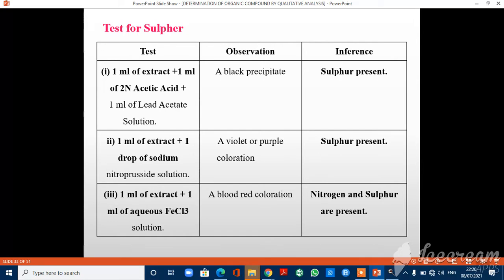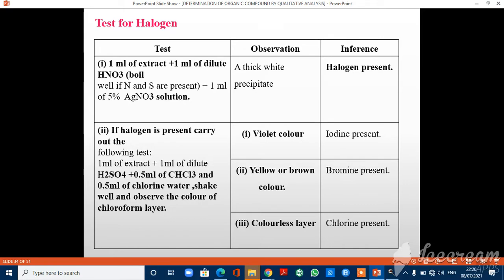Another test for sulphur: add 1 ml of extract plus 1 drop of sodium nitroprusside solution. If a violet or purple coloration is observed, sulphur is present. A third test: 1 ml of extract plus 1 ml of aqueous FeCl3 solution; if a blood-red coloration is observed, both nitrogen and sulphur are present. Test for Halogen: Take 1 ml of extract plus 1 ml of dilute HNO3; boil if nitrogen and sulphur are present. Then add 1 ml of 5% AgNO3 solution. If a thick white precipitate is observed, halogens are present in the compound.